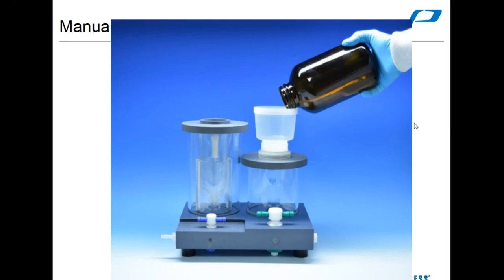It talks very specifically about rinsing all surfaces that the sample has touched with hexane. Part of your elution process is you're adding hexane into that bottle. You shake the hexane around to remove anything that's adhered on the glass. You also will rinse all parts of the filter funnel, whether glass or plastic, with hexane to make sure you've removed everything. Avoid water droplets in the collection flask—it's all about the sodium sulfate. 1664B gives lots of options in removing water. It talks about phase separation paper. We use sodium sulfate because that was the gold standard mentioned in the method.